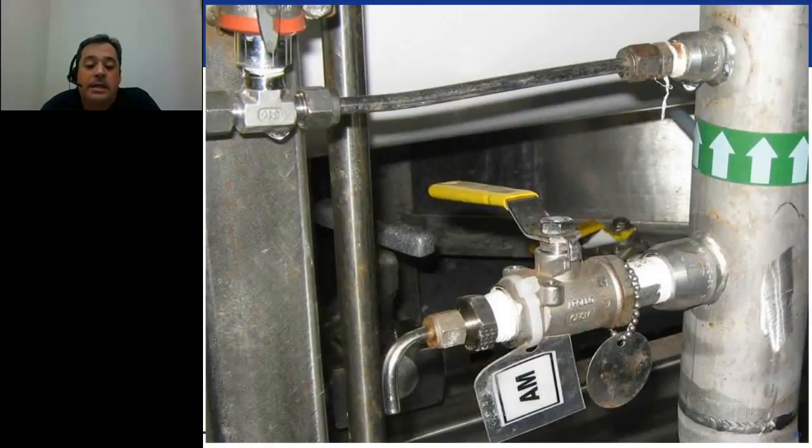All right, so this is the second question. This one really, I'm just going to ask you to use the question and answer box. We're not going to actually do this as a poll. This is an image of a water processing system. It's actually not a pharmaceutical manufacturing system. However, it has some issues with it. Some that I'm even concerned about just from a water handling standpoint, but definitely ones that I'm worried about if this were used for manufacturing in the pharmaceutical environment. So take a minute, go ahead and use your question and answer tool, and let me know if you see any issues that are occurring there.